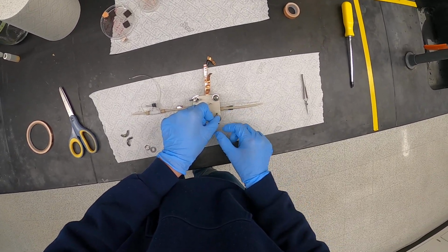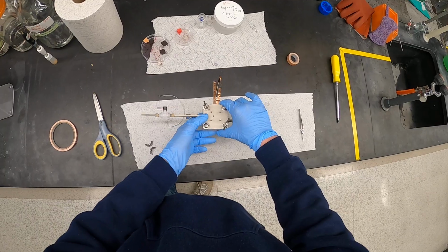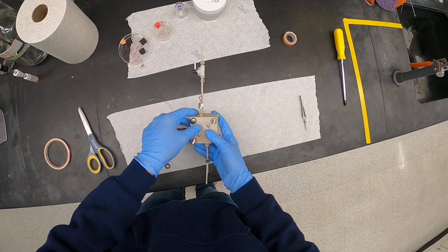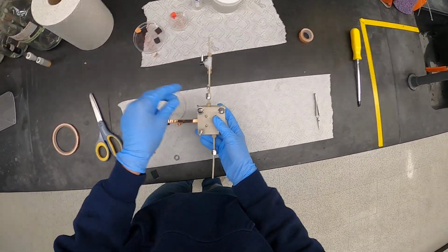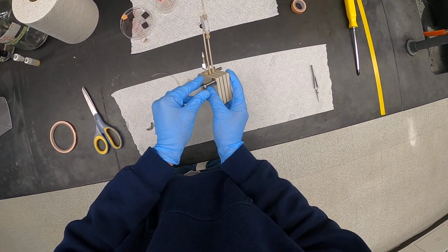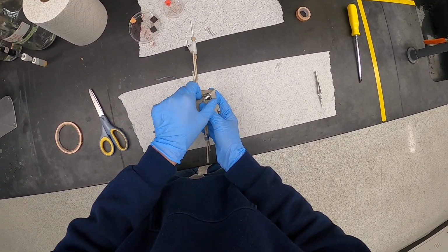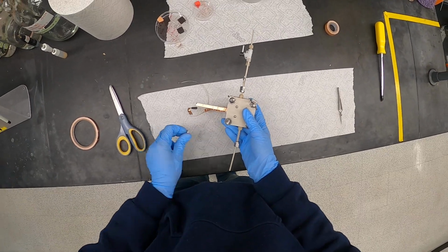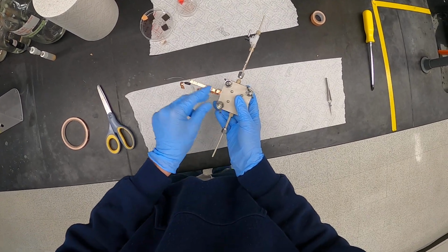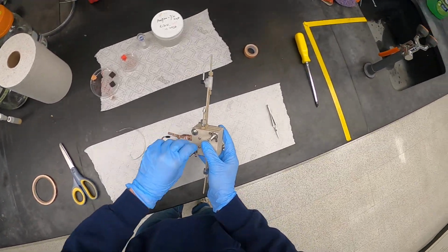Spins. Great. Now I'll pick up the whole cell, grab it by the plates, and what I'll do is I'll put 2 fingers over those big nuts, inside those big screws, and flip the whole thing around. Now I can put on the other 2 wing nuts. Get on there. There. And the last one. Cool. And hand tight. Now we need to tighten them with a screwdriver.